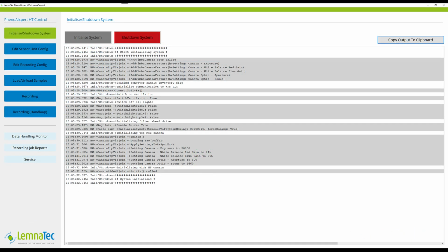When the system is not in use at all, use the shutdown function in the control software to stop the system operating. When it is shut down, no recording will take place even if there is something scheduled. So beware not to shut down a system when the scheduler mode is on.